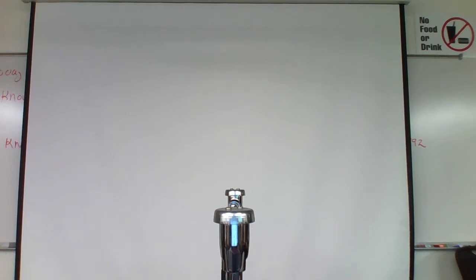No, I think this is cheap. Just a second. This one does not have a lobe. I have to find you one somewhere else. So let's try right about here.